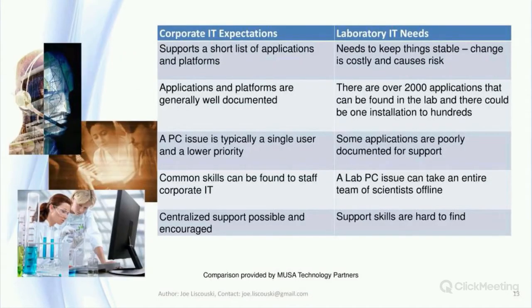We looked at this slide in the last webinar. The point was to contrast the typical corporate IT expectations with the needs of laboratory work. One is more structured, the other has more diverse needs, and has their computers connecting to equipment that is beyond the experience of most IT people.